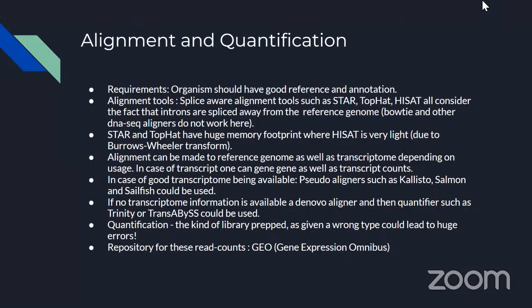So these counts are actually only used for differential analysis, pathway analysis, and several other analyses. There are many alignment tools that are specific for RNA-seq. So why do we want new alignment tools different from what we use for DNA-seq?